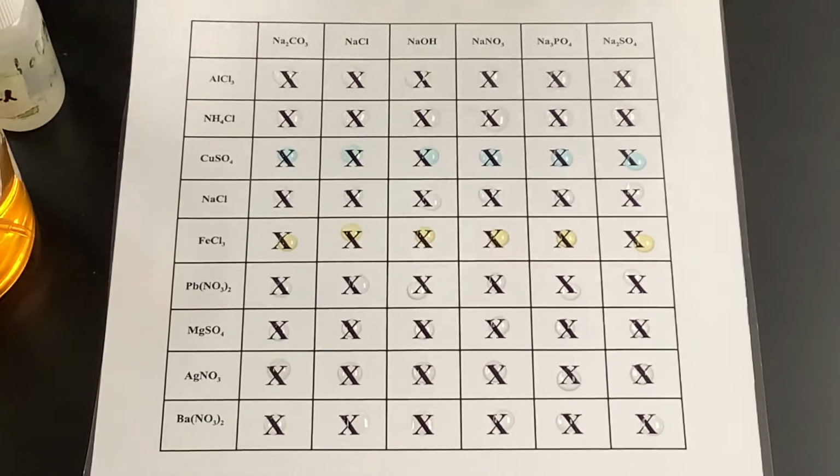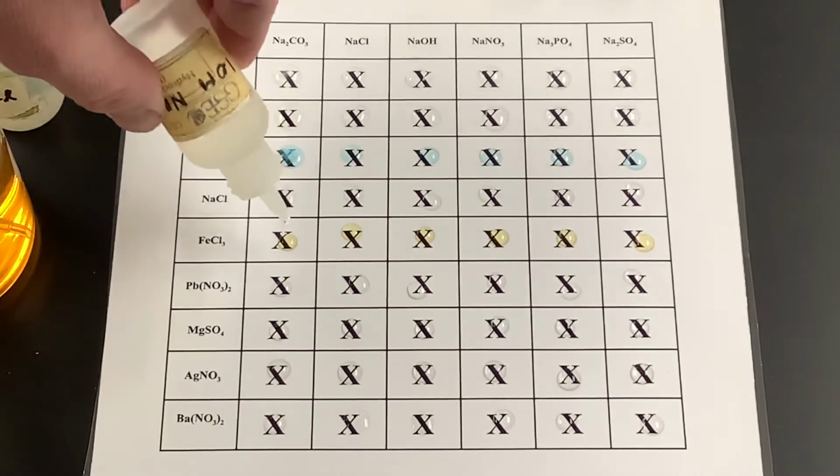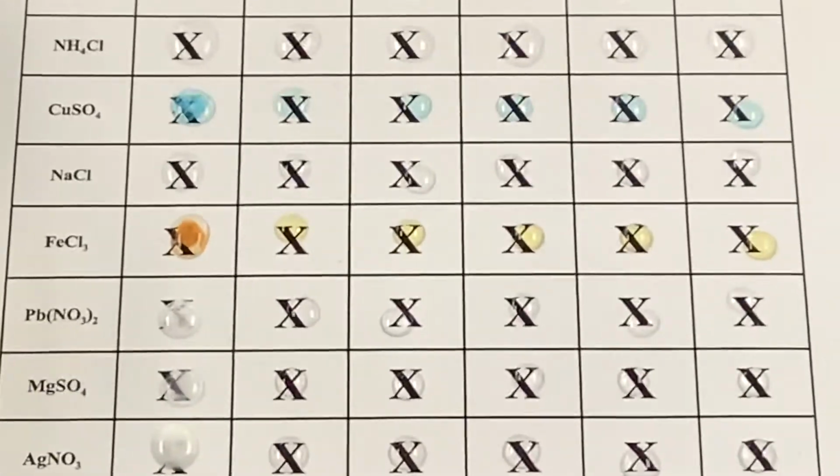So we're going to go ahead and get the carbonate going here, and we're going to go right down the way. Looking at these, you can see that certain ones of them don't like to dissolve. For example, if we look at the aluminum carbonate, we'll zoom in on that.